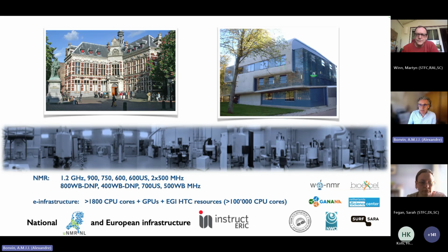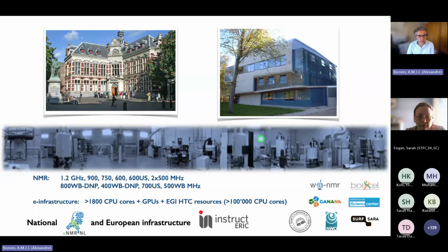In this building, we host a very large infrastructure for NMR, having both solution and solid-state NMR, with 1.2 gigahertz magnets. We have also been connected to the European grid, or the European Open Science Cloud these days, having access to more than 100,000 CPU cores distributed around Europe and the world. And this is very important to power the services that we're offering to the community.